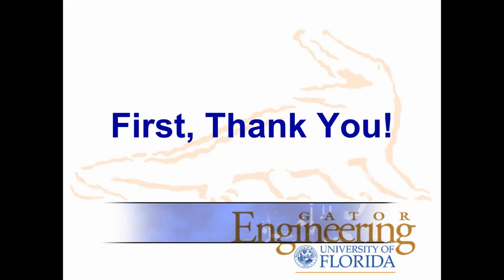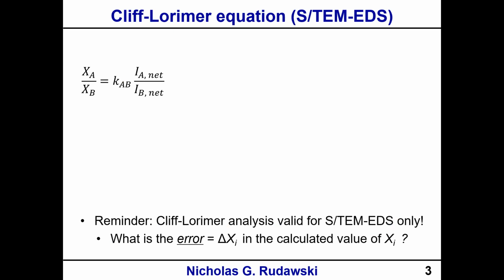So anyway, what we're going to talk about today. We started off in the presentation about quantitative STEM-EDS. And again, if you haven't seen that video already, please go watch that first, or else this one's probably going to be a little over your head.